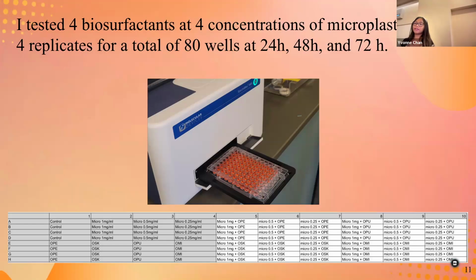I tested 4 biosurfactants at 4 different concentrations of microplastics with 4 replicates for a total of 80 wells. This was then replicated 3 times for the time periods of 24 hours, 48 hours, and 72 hours. In the first picture, it shows the cells in the plates that we tested them in, and the bottom picture shows what was in each well, or each hole of that plate.